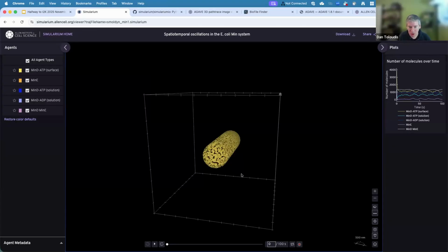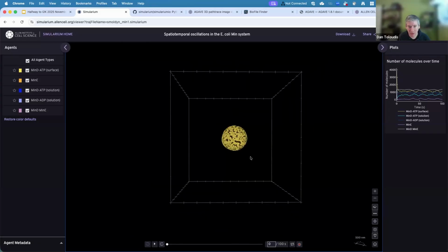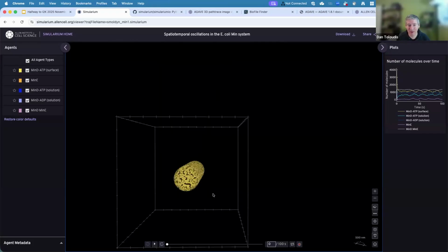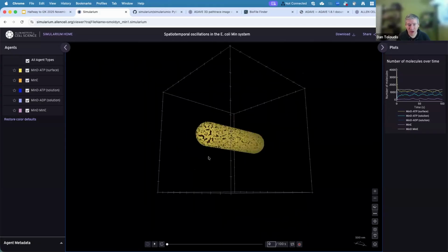And for panning, I'm on a Mac, so I'm using a two-finger click and drag on the trackpad to pan side to side. You get used to these, and they become intuitive after a while.